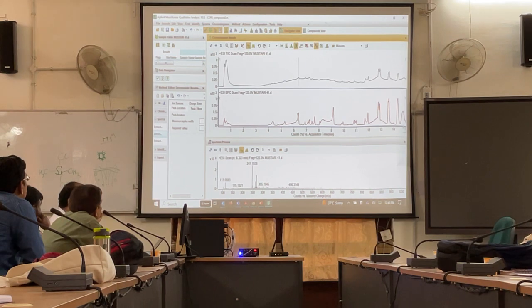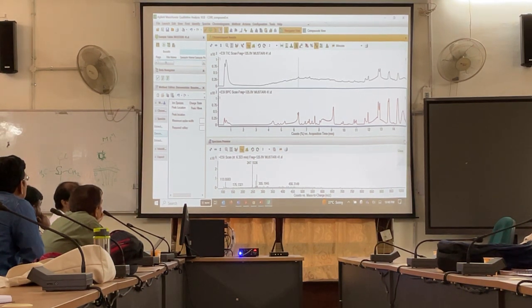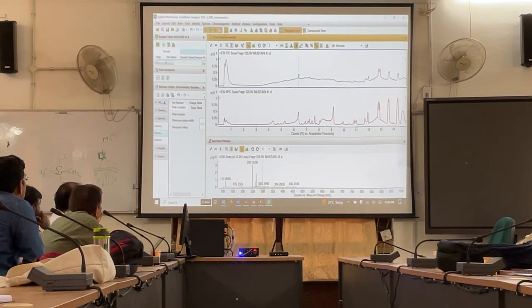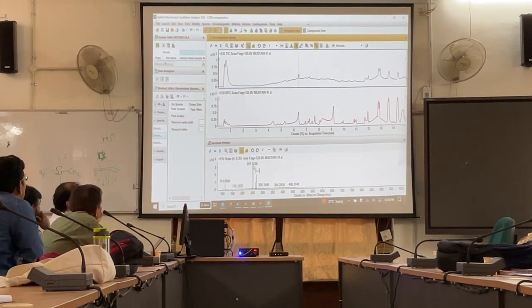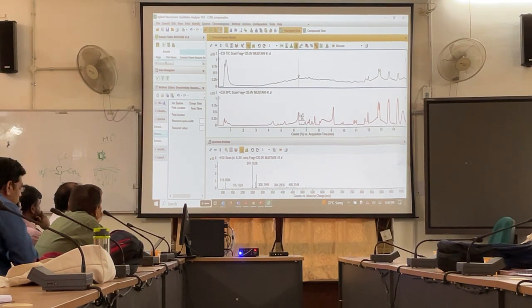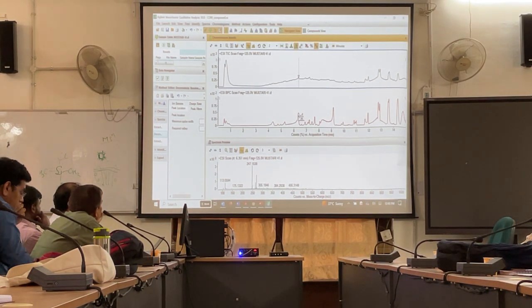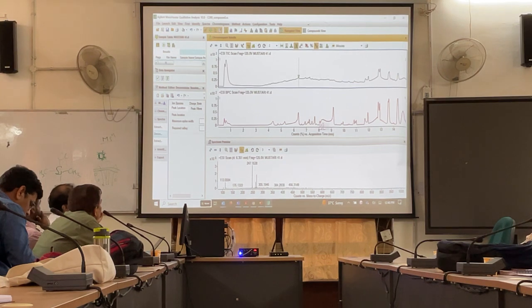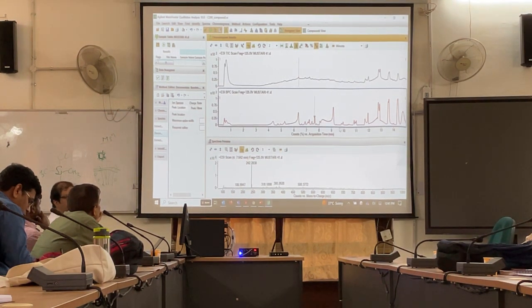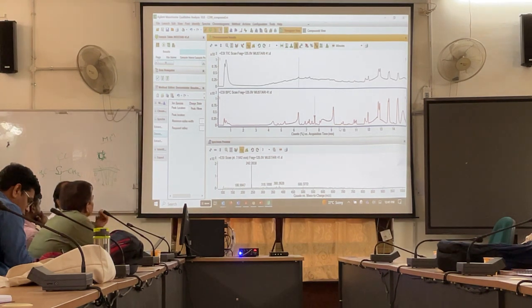So what is the BPC here? BPC means base peak chromatogram. For any point of time, if I click here, the base peak for this spectrum is the most abundant peak, which is 247. So if I calculate the abundance of this peak at this time, this is the BPC abundance. If you see, BPC looks much cleaner than TIC, especially for HRMS. Why? Because in BPC, only the most abundant peak is considered. The background or less abundant peaks are not considered.